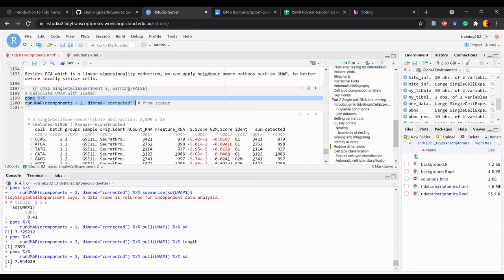And Fadel as well. So differently from PCA, where each component is independent of the others, for UMAP, if you calculate 2 components or 3 components, those 2 operations are not invariant for components 1 and 2. So if you calculate more components, the variability gets distributed across components. That would not be obvious if you think about PCA.